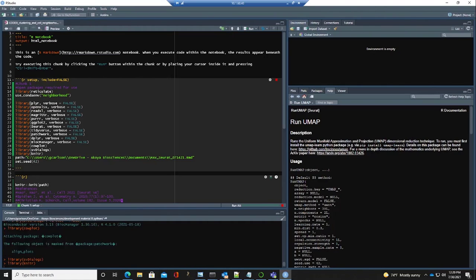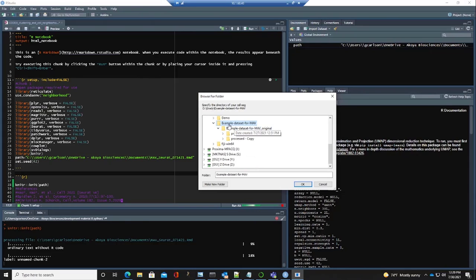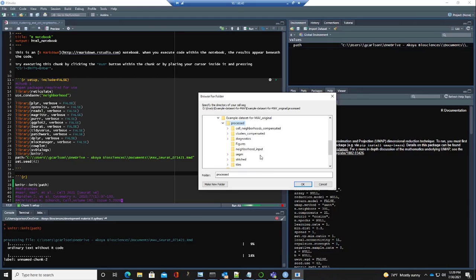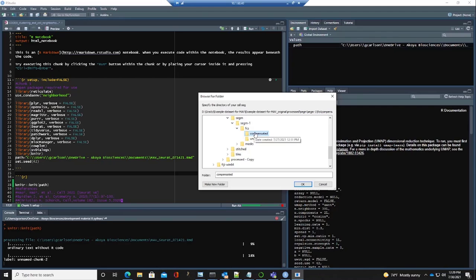We're opening the libraries. Now it's going to ask for our single-cell data from CODEX. Those single-cell data are located inside our experiment file — here we're using the example dataset for MAV, the processed folder, segmented data, segment one, FCS compensated. MAV is always going to export your single-cell data to this location. Now we need to type in the name of the saved file — let's type in Seurat Demo.